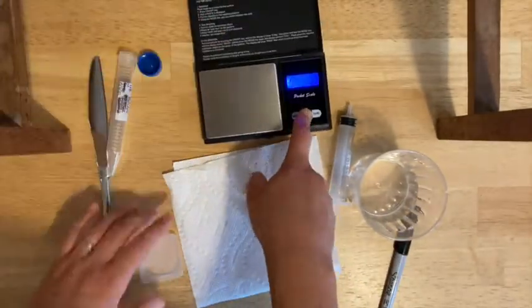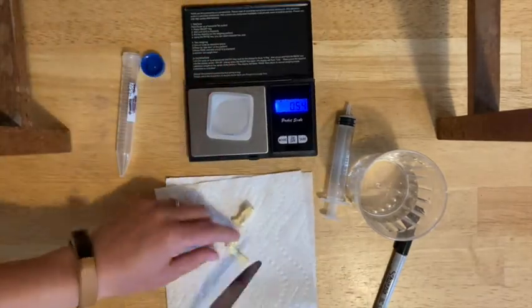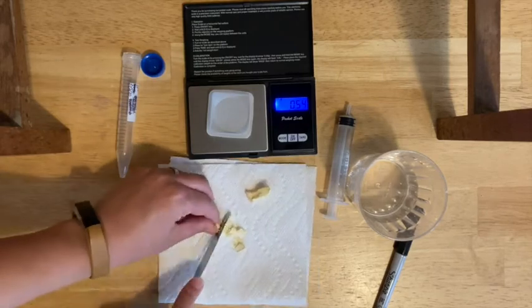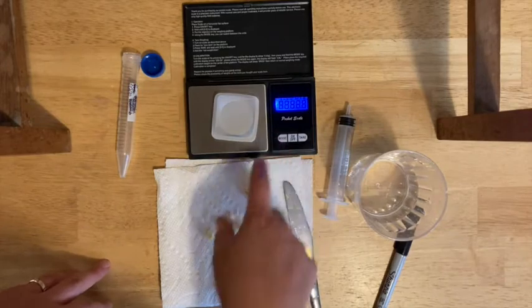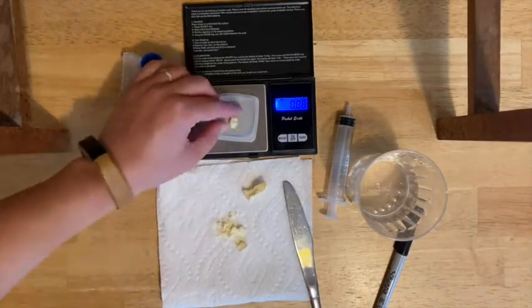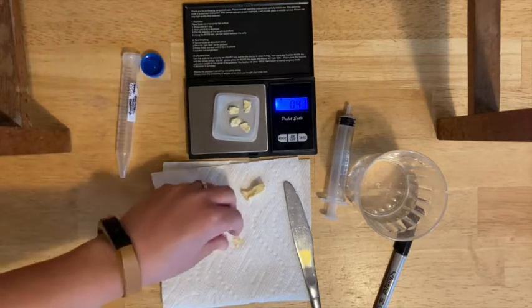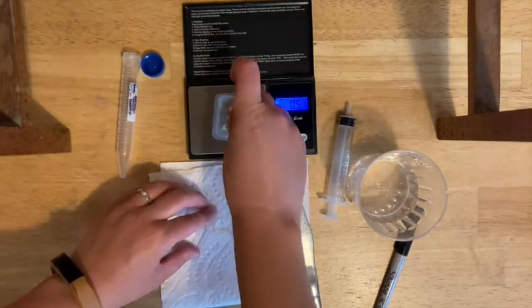Your next task is to weigh out one gram of the freeze-dried pineapple. I'd suggest cutting up your freeze-dried pineapple into little pieces to make it easier to get the exact weight. Make sure you use your weigh boat and zero the weigh boat before you get going, and then you're going to weigh out one gram of pieces of dehydrated pineapple.